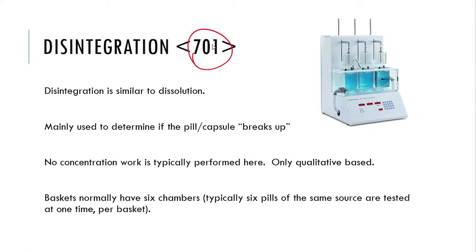And this is even easier, okay? It really isn't even as complicated as dissolution is, but it's very similar. The only thing that we are monitoring here is how that pill breaks up. Does it break up? Yes or no? That's the question. We're not actually pulling any aliquots from these typically. It is just simply a dunk tank. That's it, folks, a dunk tank. And the pill is sitting in the dunk tank, and it's going to get dunked over and over and over. So I hope that you're a good pitcher or a good thrower.